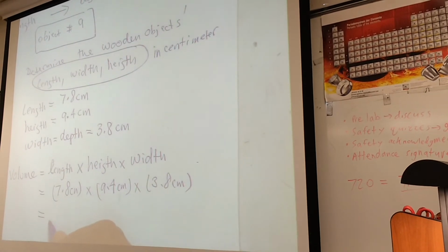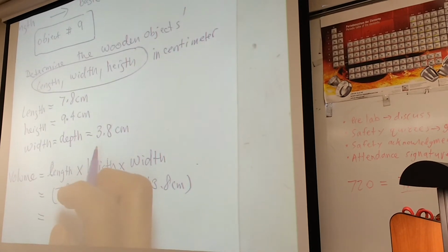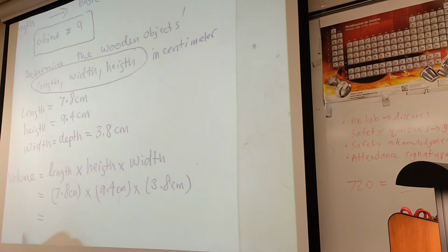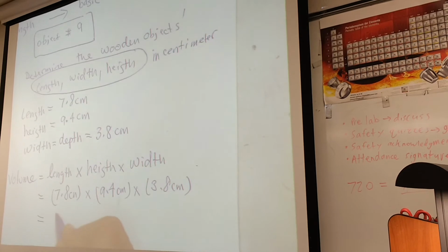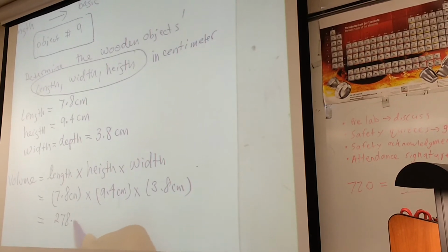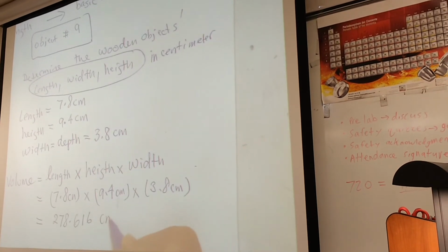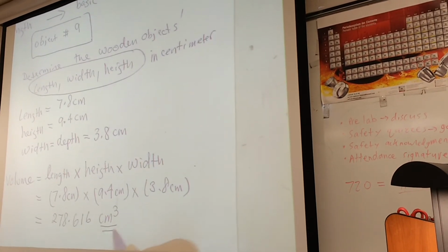278.616? 278, and how much? 0.616. Centimeter cube, correct? That's a volume here.